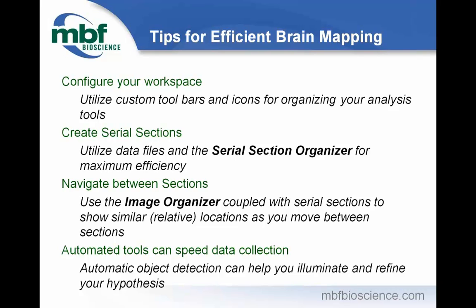Now, there are a lot of tools that we went through today that really come together nicely. All of those tools that we talked about today are available in previous versions of Neurolucida. And we took pains today to talk about how version 11 is just improving the throughput and efficiency. While we talked about creating all of this data today using virtual slides, you can create this data using your slides under the microscope and just trace as you go. So that option is available to you.